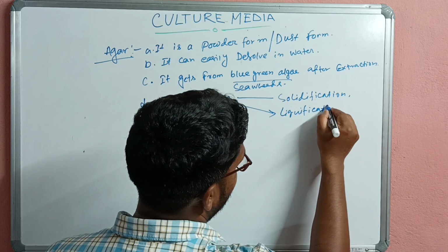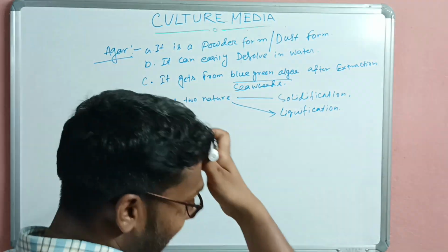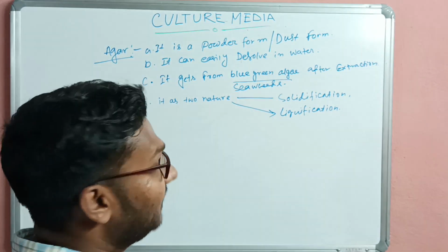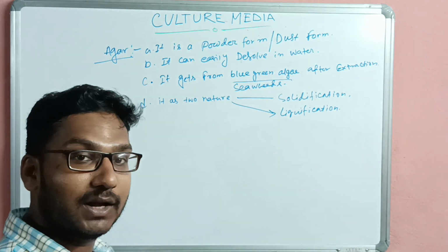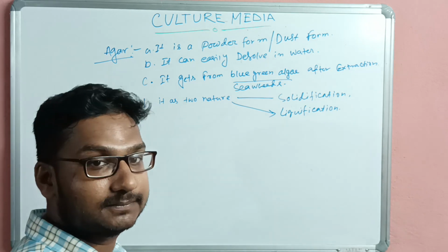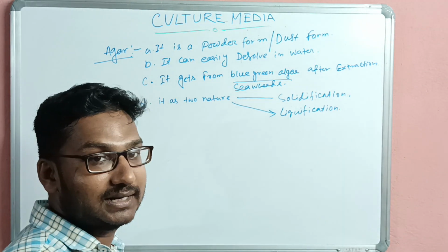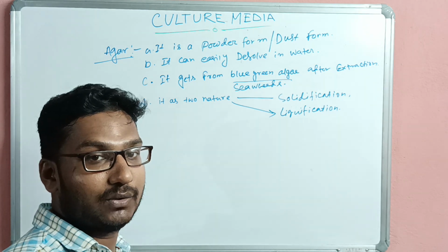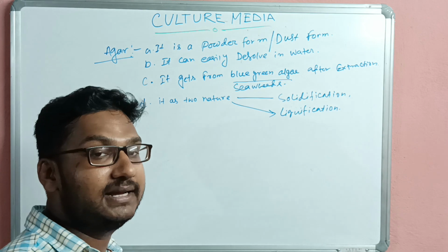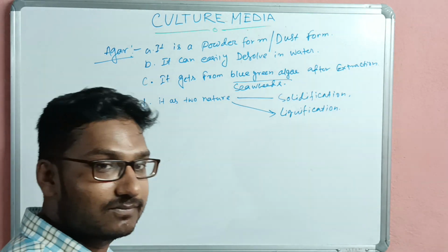After dissolving this agar powder with water, when we apply heat to the agar solution and reach 95 degrees centigrade, it will liquefy.